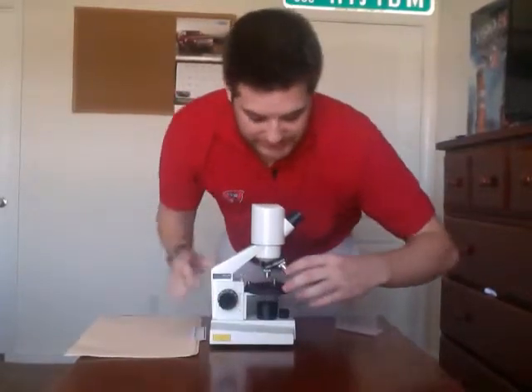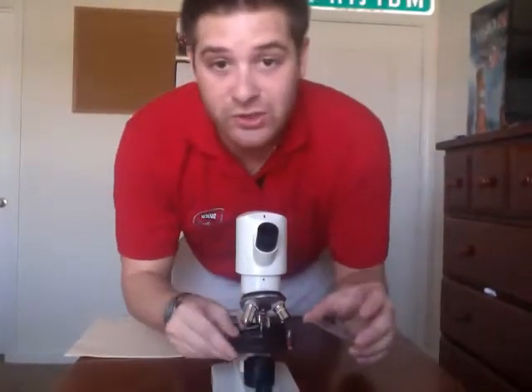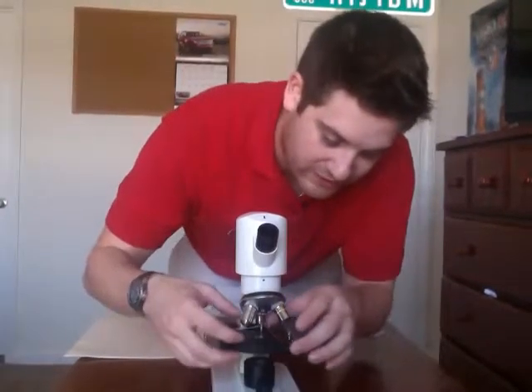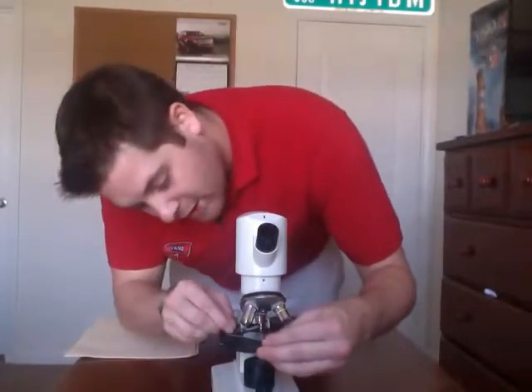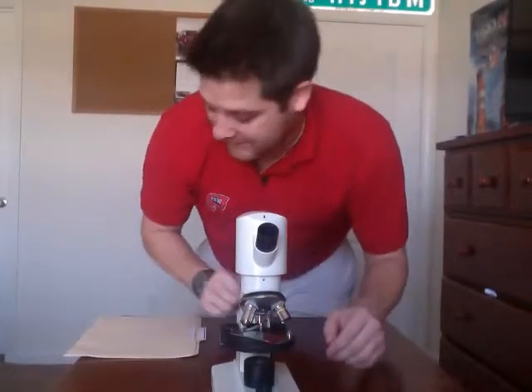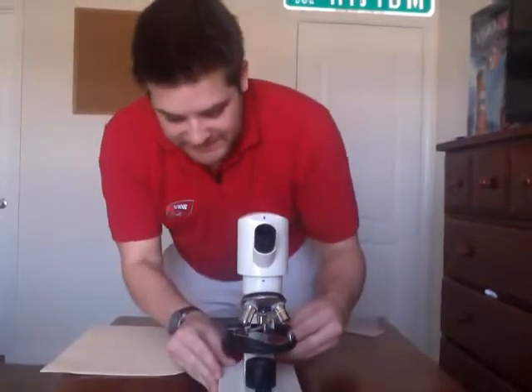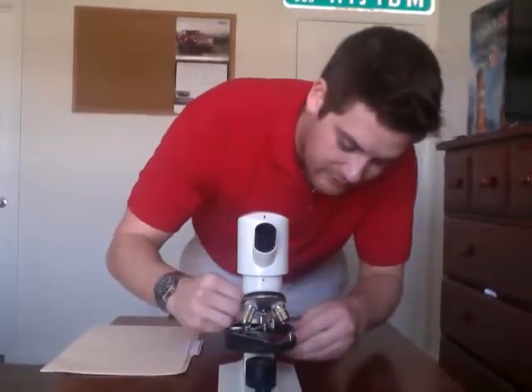And when you put the slide on, you have these two metal clamps. Once you securely put the slide on your microscope, you want to take these clamps and make sure that they are on the top outside edges of the slide, so that it doesn't move or slide or maybe even fall off your platform. So that's another big key. And when you turn on the light, you'll just have a plug and there'll be a switch to turn it on and off. I don't have it plugged in right now, but you want to make sure that it's on before you look, because you won't be able to see anything unless the light's on.